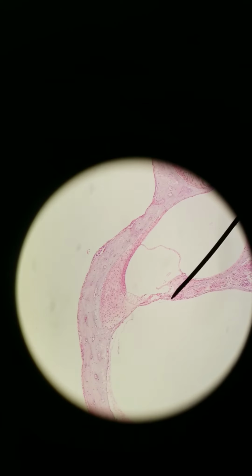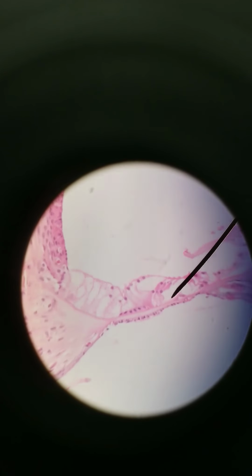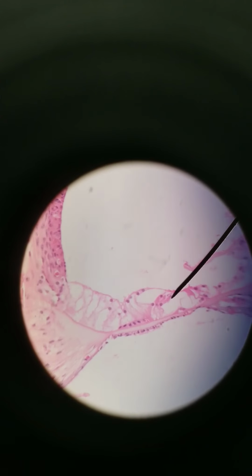This is the true organ of hearing, the organ of Corti. This is where we have our sensory receptor cells. So let's go a little closer so we can see them better. These cells that you see here, like what I'm pointing at here, these are called hair cells.